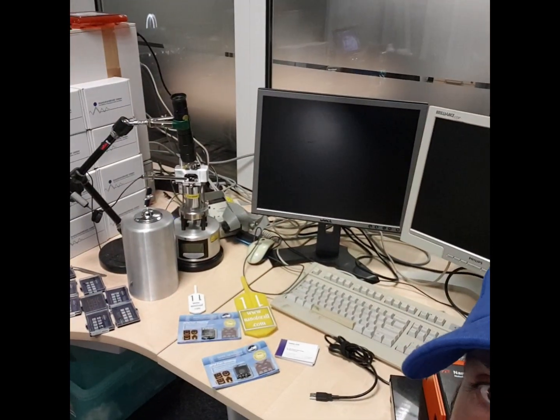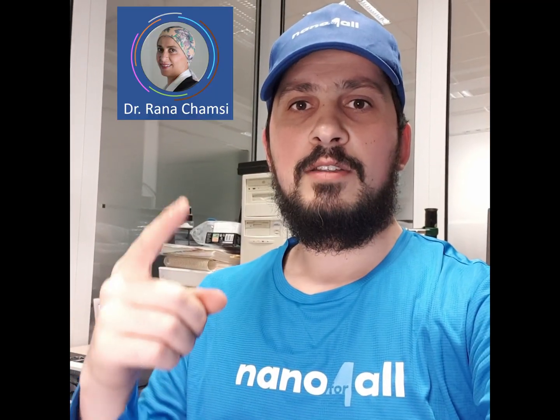Behind me here is a group of nanoscopes from other companies. These machines are quite amazing — they can bring you to the nano scale or even to the atomic scale. But they are quite expensive; one unit could cost as high as the price of a house.